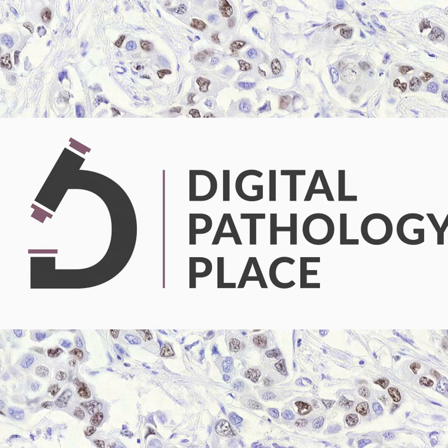Okay, Lorenz, you are the image data science director, right? So where are the greatest pitfalls on the transition from image analysis to analyzing this data that might make this effort less meaningful? What are the problems that you can encounter? Something that can happen, like a mistake, or something that can cause your downstream analysis to not provide value, and how to mitigate this? That's the most important question. Where do we need to be aware of things that can go wrong?